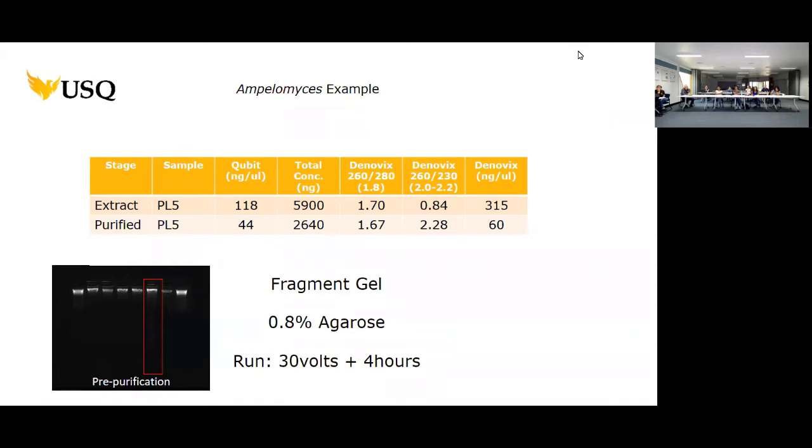What I would say about this kit is that I haven't used it too much, but I think there is a lot of room to optimise it so you don't lose that much DNA. I'll probably have a play with that and try to optimise it a bit more, but I think you'll find that you won't lose that much DNA as we go on. It will improve.